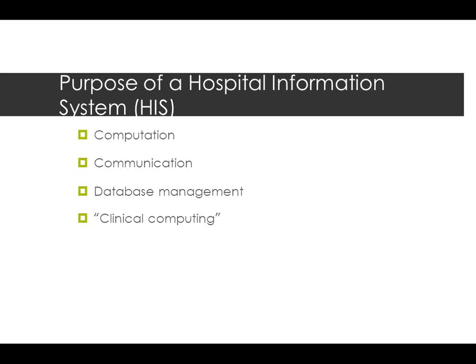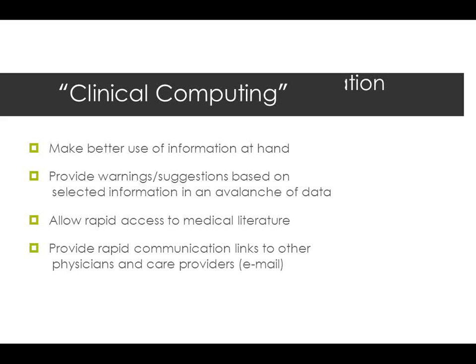with information, tools, lab tests, radiology, communications, maybe reminders, maybe things that would say, oh, hey, your patient's on DIG and we see that your potassium is going up. You may need to look at that, so flags and those kinds of things as a way to help physicians deal with the avalanche of data that they were being faced with more and more.